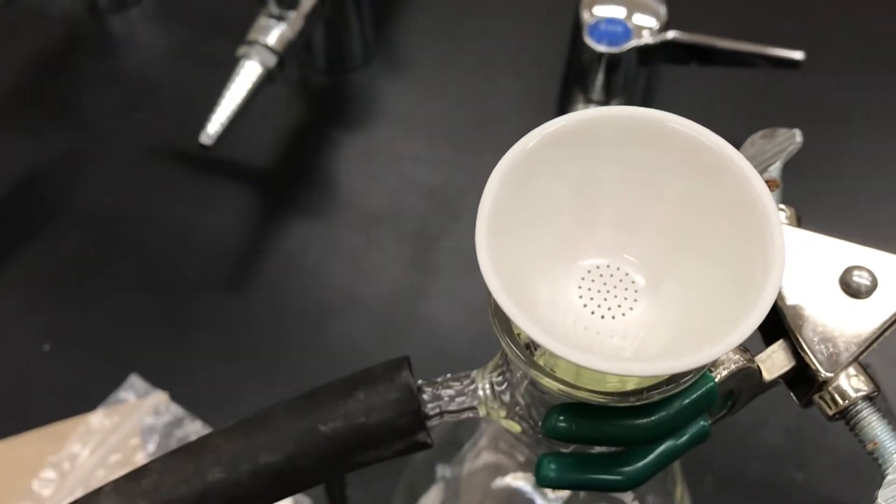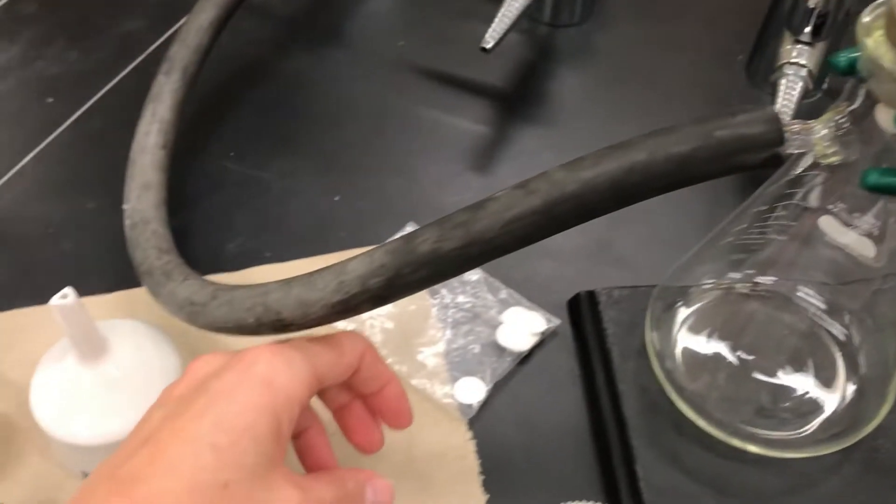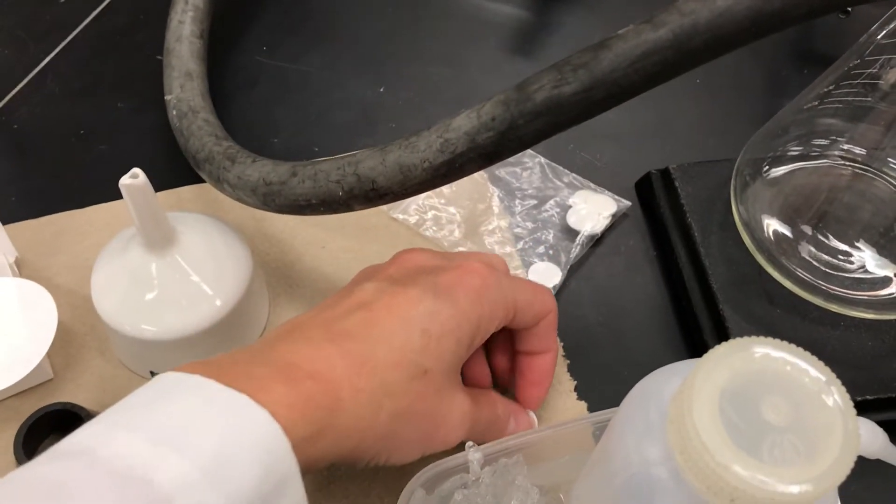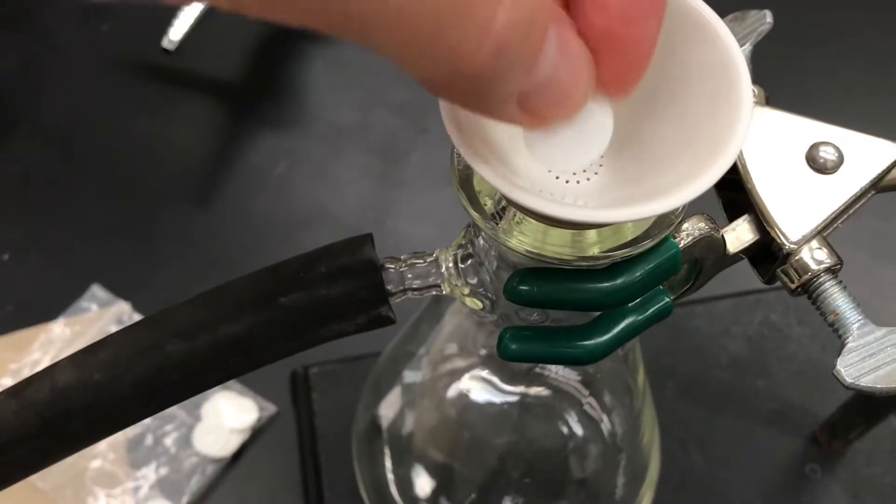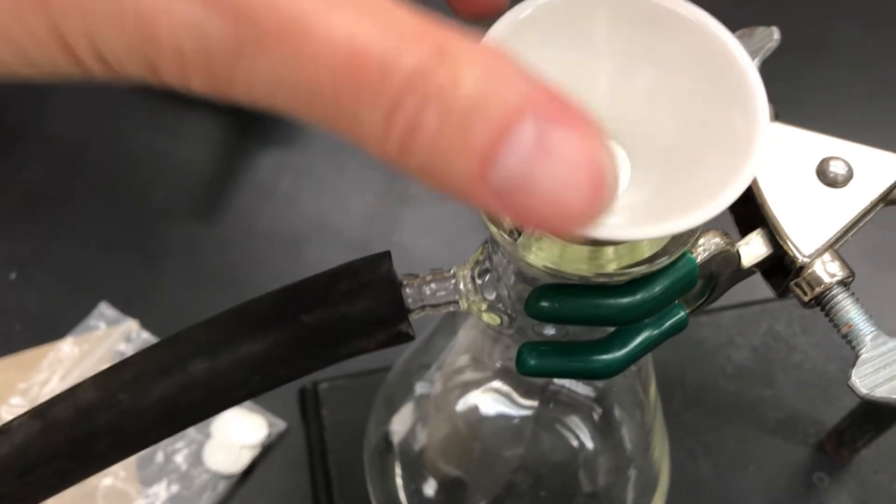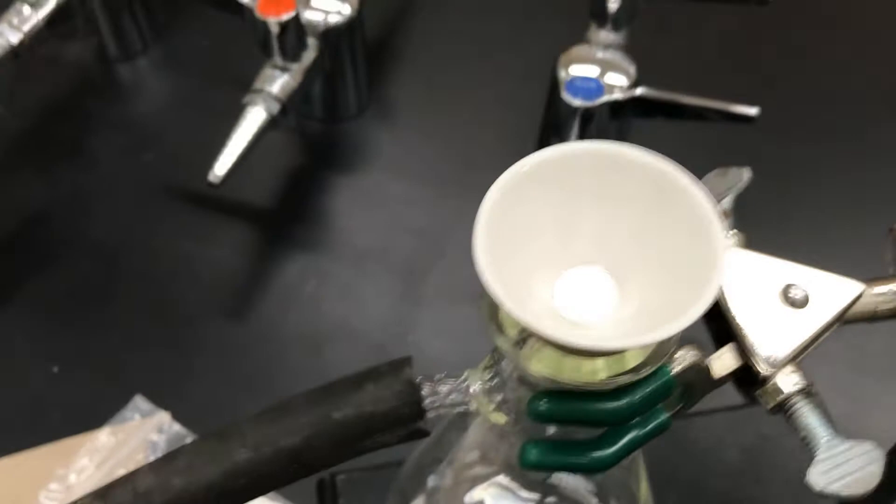The funnel does have holes in it, and so if we poured liquid that would just stream in. So we need to first put a filter paper to block the holes. Add this tiny little filter paper over top of the holes and now it's ready.